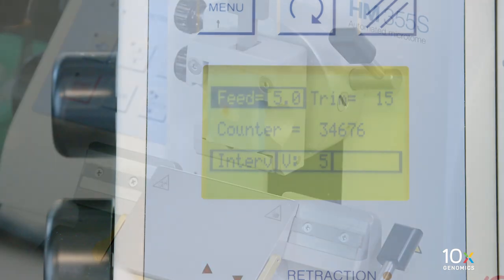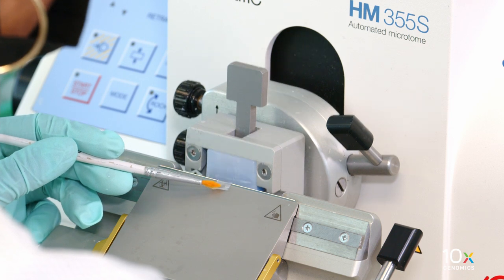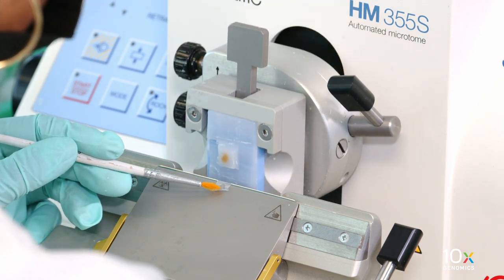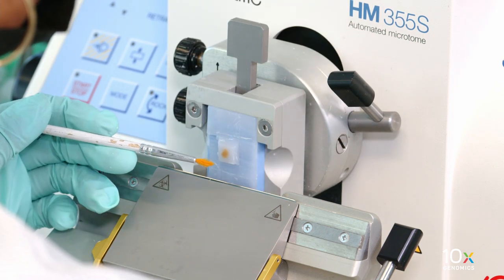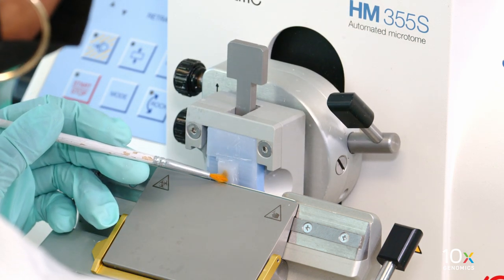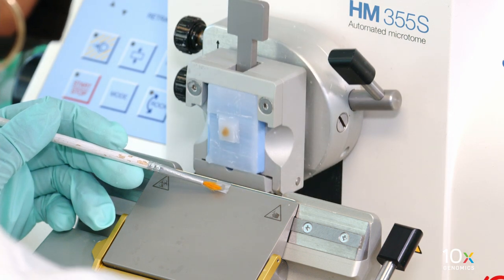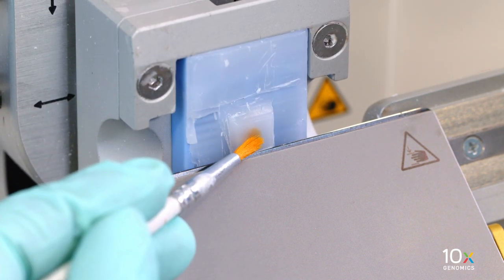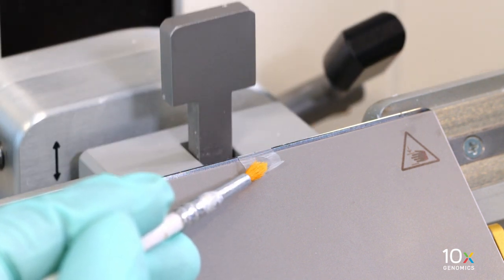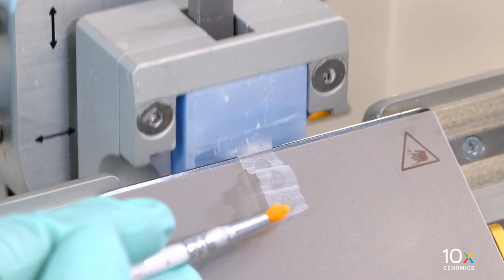Set the microtome to 5 microns for tissue sectioning and begin sectioning. For tissue blocks with exposed tissue, discard the first few sections and start collection on the subsequent sections. Perform sectioning in a continuous motion to get a ribbon of sections. To collect sections, place the paintbrush tip slightly above and parallel to the blade, and lift the section by lightly touching the edge with the paintbrush while rotating the wheel handle.